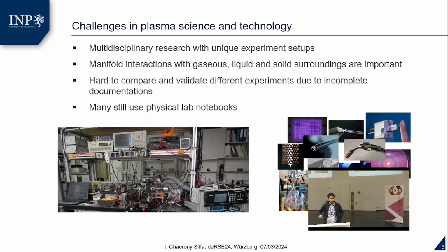So maybe we start with the motivation why we need this tool, like a statement of need. So in our field of research, this plasma science and technology, this whole thing consists of multidisciplinary research. And we have different unique experimental setups, so it can be different from group to group, although we're still doing this plasma research. Not only physicists, we also have biology people who apply these physical plasmas to biological substances. And there are so many interactions that we have to record or document, how this plasma interacts with this biological surface or a solid surface, and so on and so forth.